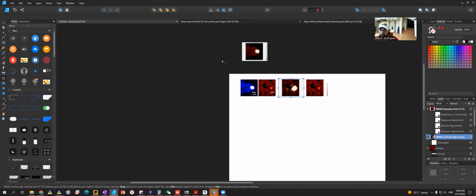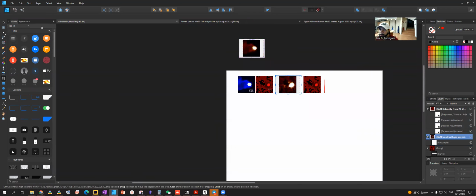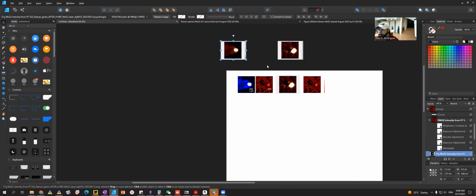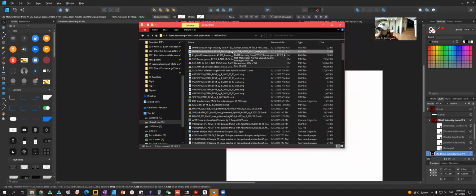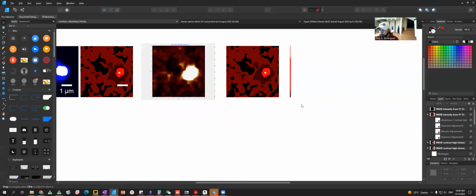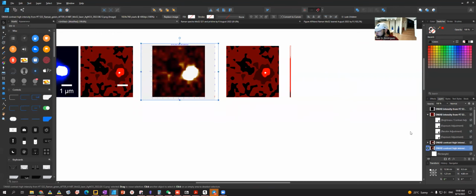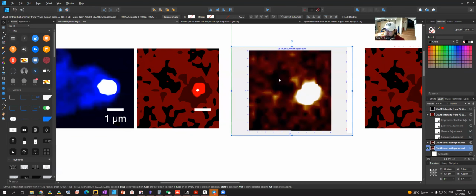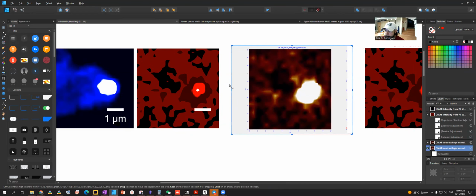Remember also that before you do that, you need to keep the originals. And this is this one, so that one is this one. So passing things to this one, also manually the cropping of the things that we don't need.